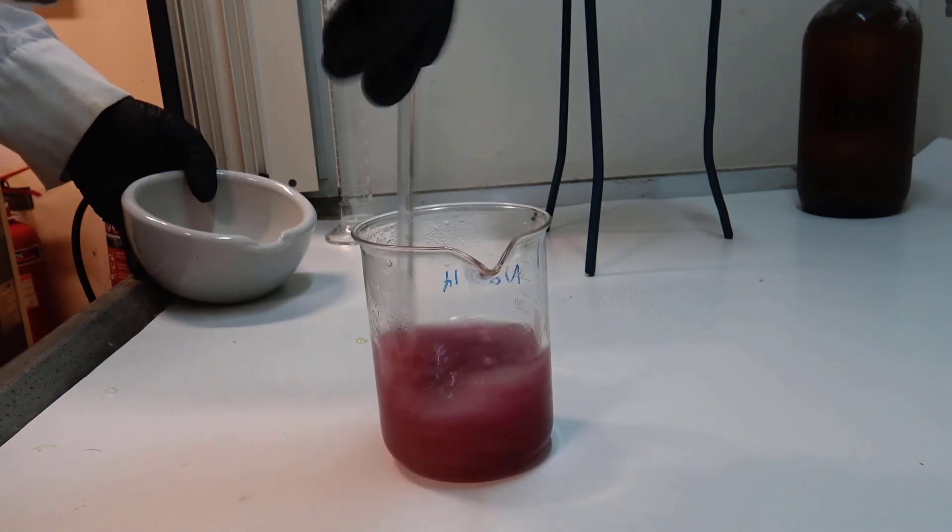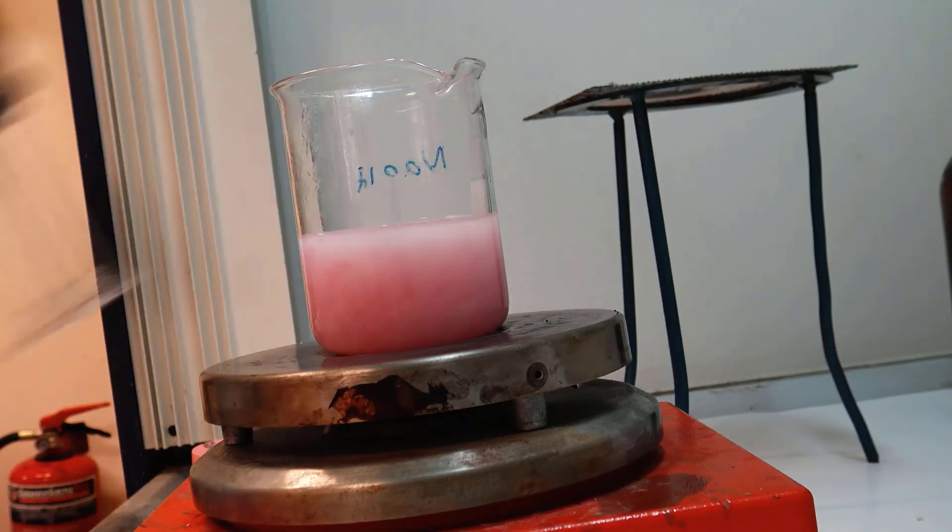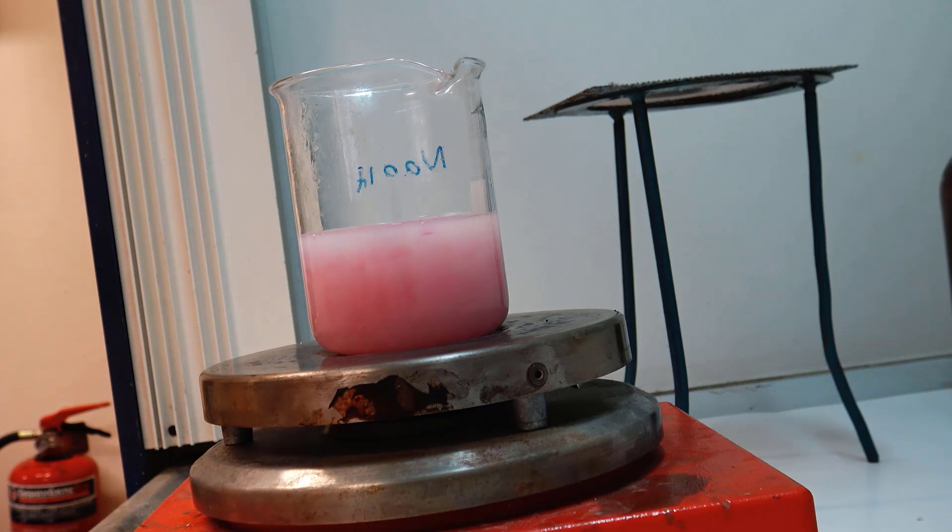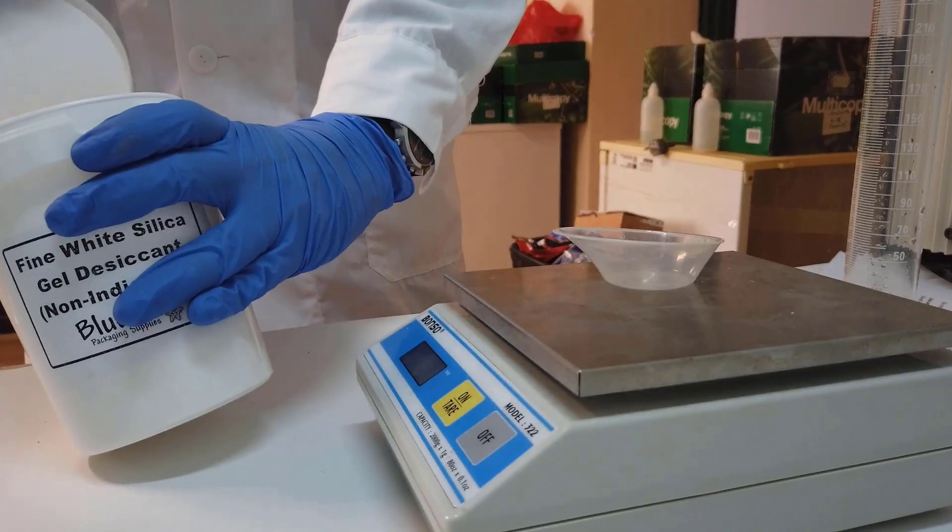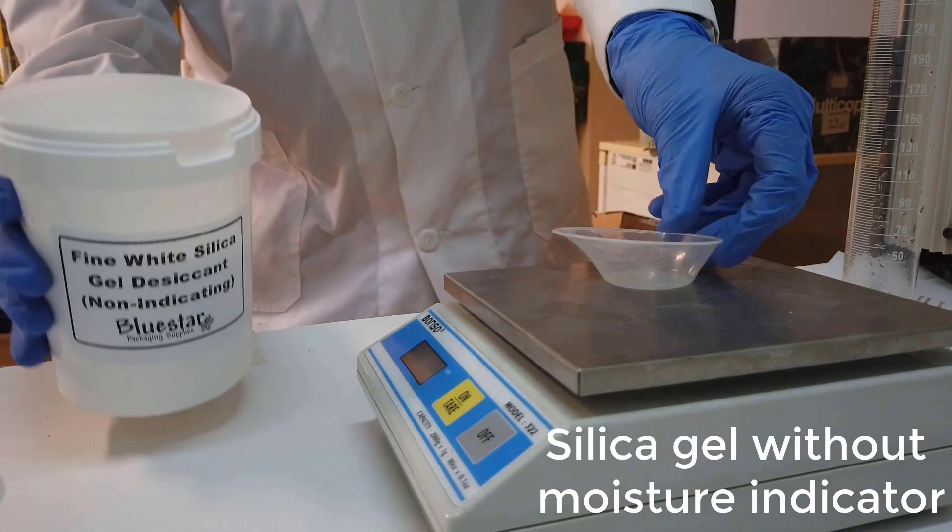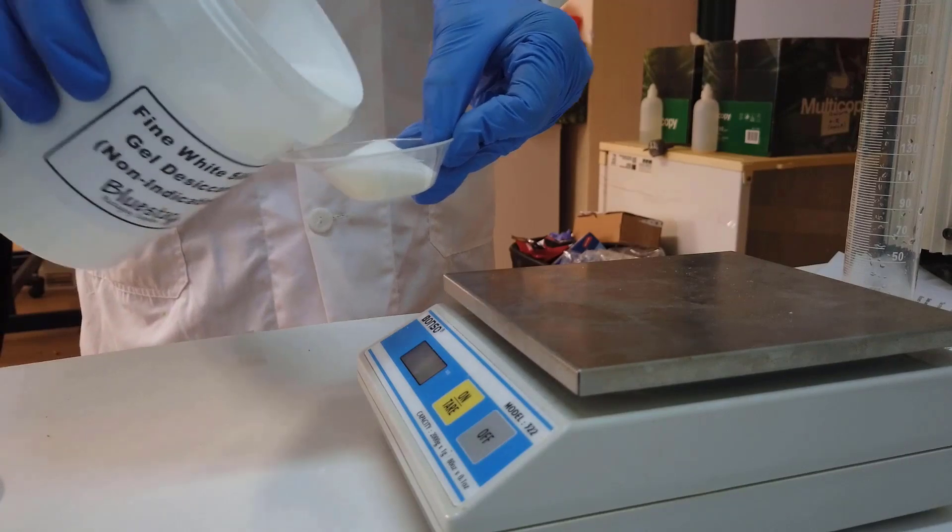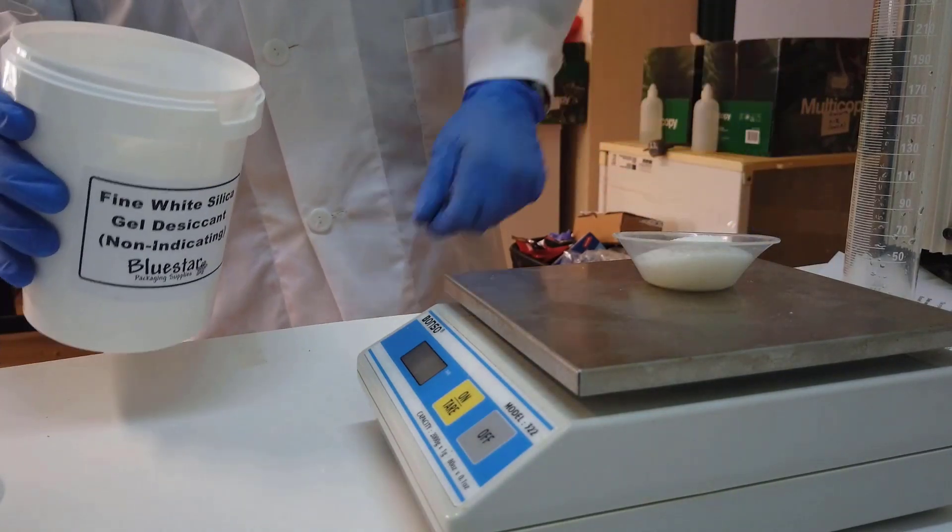However, the orange moisture indicator turned the solution dark pinkish red and therefore unsuitable for the chemical aquarium experiment. Now I had to get an indicator-free silica gel and I found this one on eBay, which is really suitable because the gel beads have really small diameter.